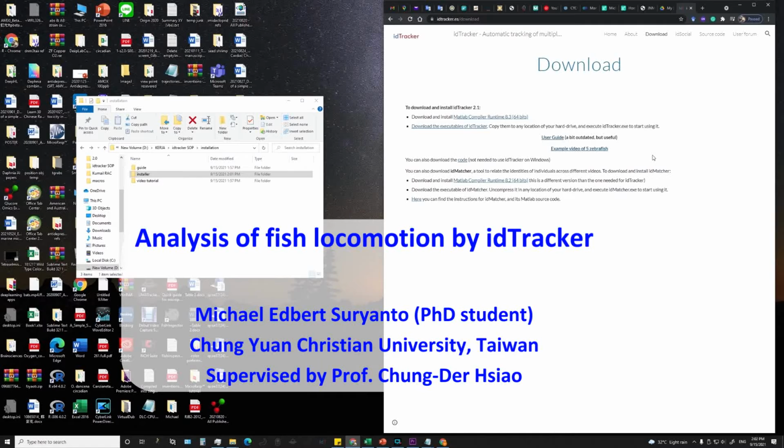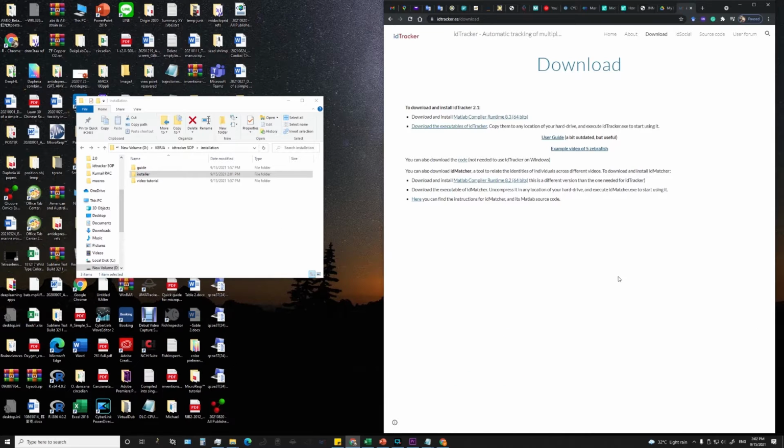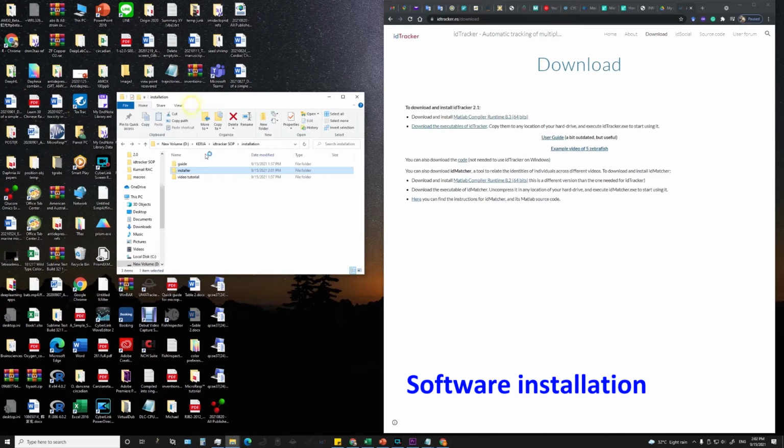My name is Michael. Today I would like to demonstrate how to install the idTracker. You can download the idTracker files and software from this website, idtracker.es/download. First we need to download and install MATLAB Compiler Runtime 8.3, and then download the idTracker software. I already downloaded it, so let's install.